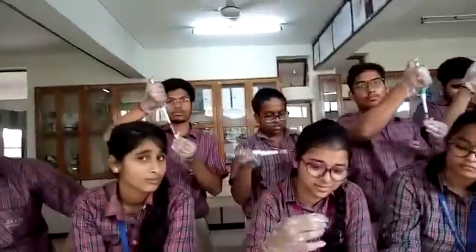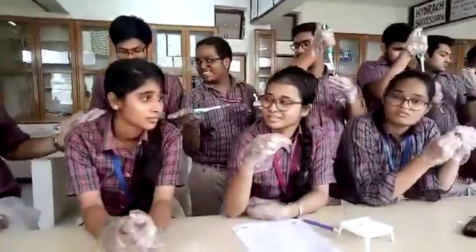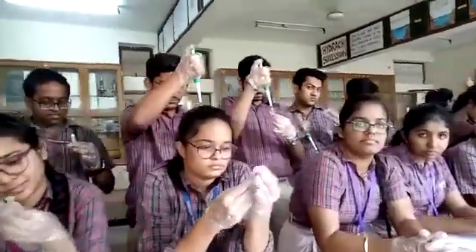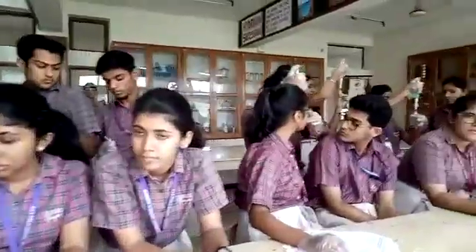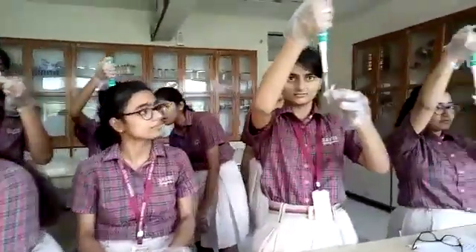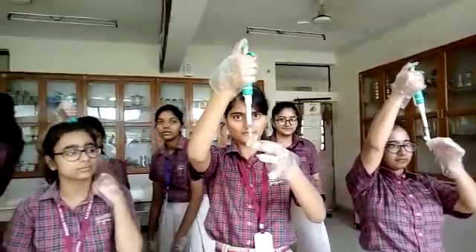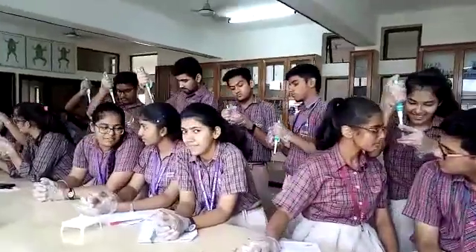If there is too much bubble, stop your work right away. Otherwise what happens is the liquid will come out, touch your finger, and spread contamination, as well as cause loss of liquid. So you have to avoid the contamination. Just stop here — too much bubble formation makes a problem.